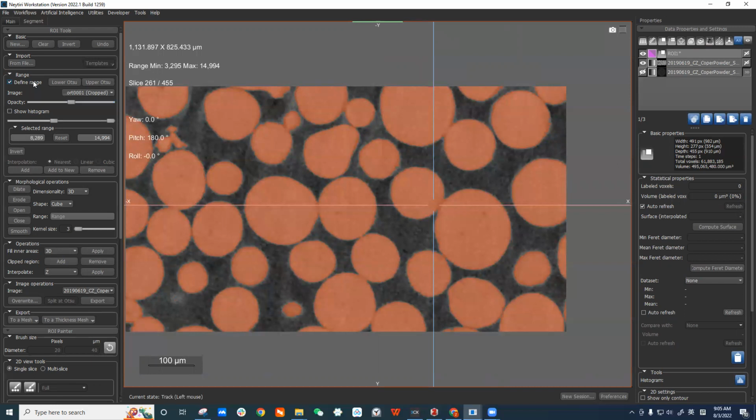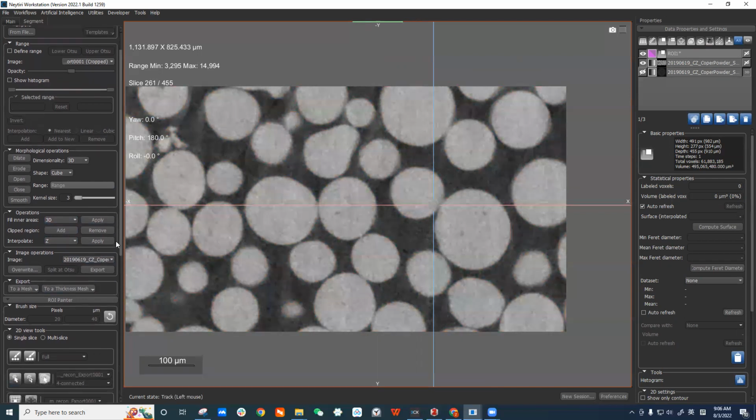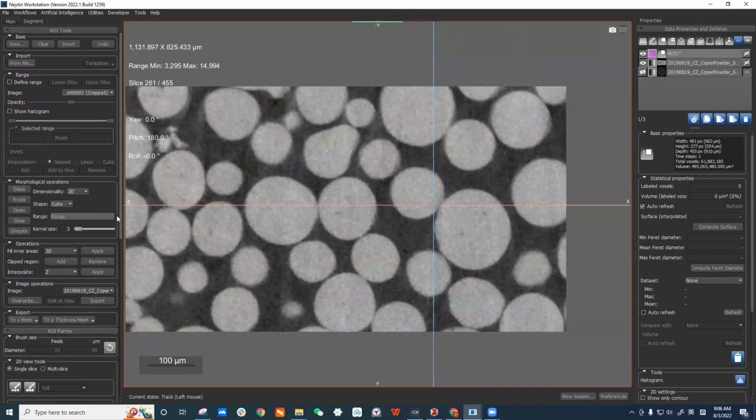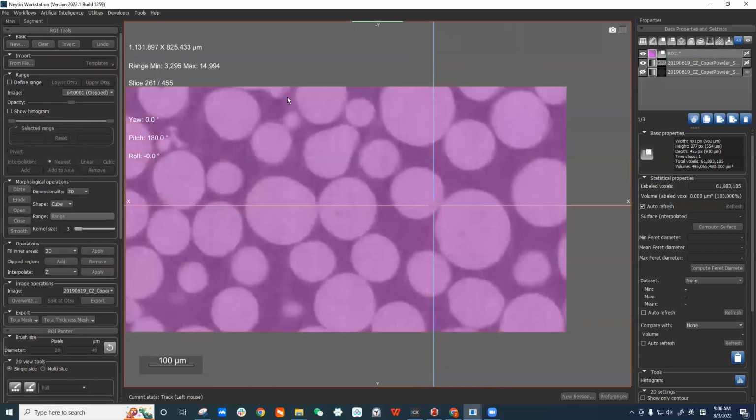And I'm not going to use this. I'm going to use a tool called Otsu. Where is it? Oh, it's here. See, we have a button here called split at Otsu. But now it's gray because I have nothing in my ROI. It's empty. I need to add something to my ROI. In this case, I add everything. So I use the full range. I add everything to my ROI, so my ROI is full.